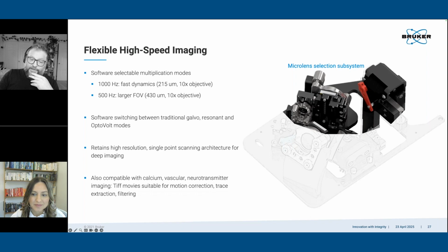My guess is that resolution would suffer from it, but I don't really have a lot of experience with that. I know that we can use these to generate, for example, multiple points for faster scanning, but I've never really experimented with using them for changing depth of field or the like. But yeah, DMDs and SLMs are not cheap. You're not wrong in that sense. Let me follow up with that, because I'm not actually sure what the end result of that would be.